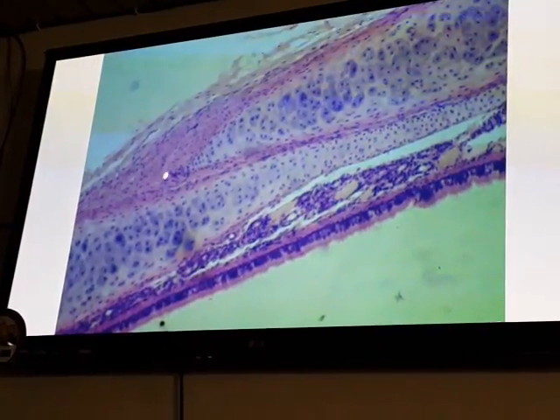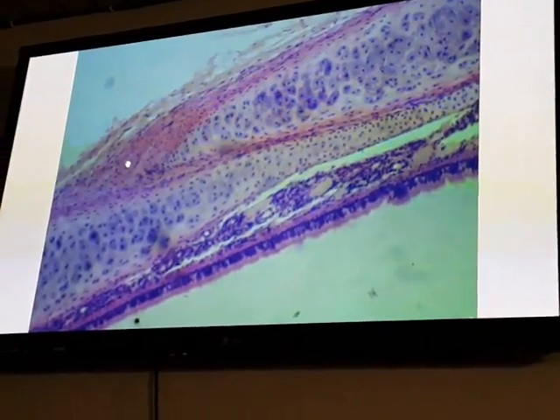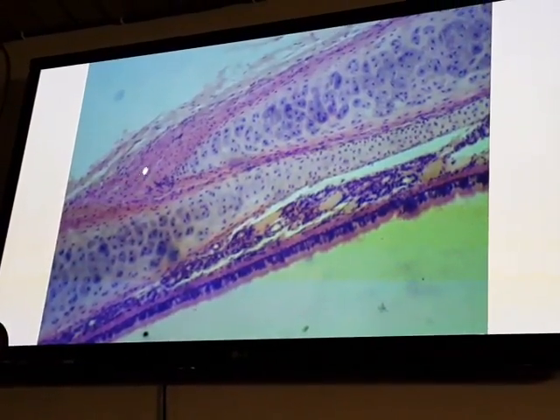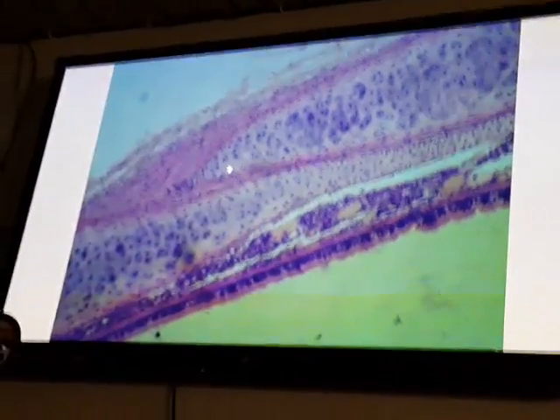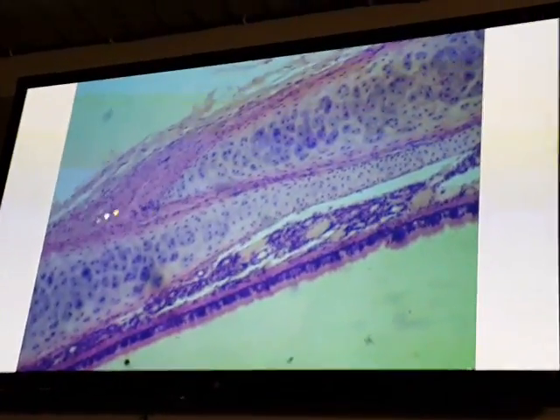If we point here, what do you write? Fibroelastic ligament with smooth muscle. These two structures bind to the perichondrium of the hyaline cartilage and bridge the two ends of the C-shaped cartilage.